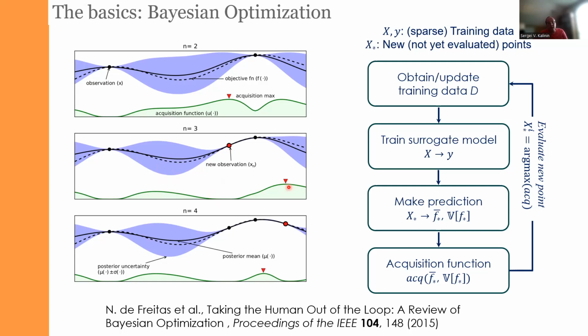If you are going to apply it to real-world problems in microscopy and imaging, there are a number of ways it can be extended. For example, if you have a maximum of the acquisition function, but the maximum is fairly shallow, meaning that there are, let's say, 5 maxima which are far from each other, but the values of the acquisition function at these maxima are comparable, then a better approach can be to choose the one which is also further away from where you are now in space.